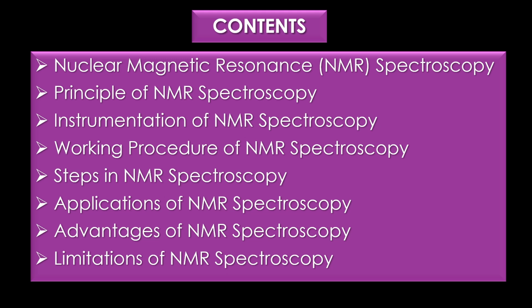First, an introduction about nuclear magnetic resonance spectroscopy, followed by principle of NMR spectroscopy, instrumentation of NMR spectroscopy, working procedure of NMR spectroscopy, steps in NMR spectroscopy, applications of NMR spectroscopy, advantages of NMR spectroscopy, and finally limitations of NMR spectroscopy.